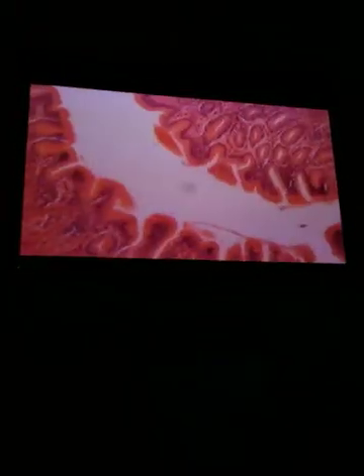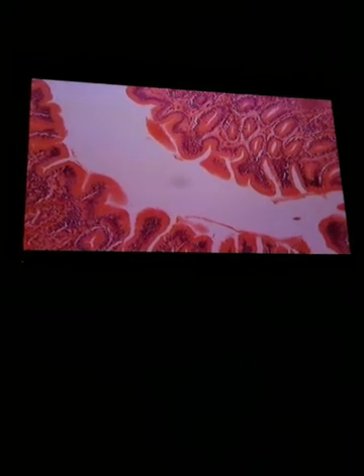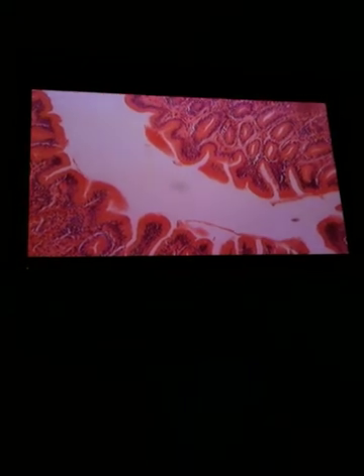Oops, went the wrong direction. These are a little different. This is actually down into the pyloric region. So again, you can see the stomach with the rugae. Let me pick it up one more time.